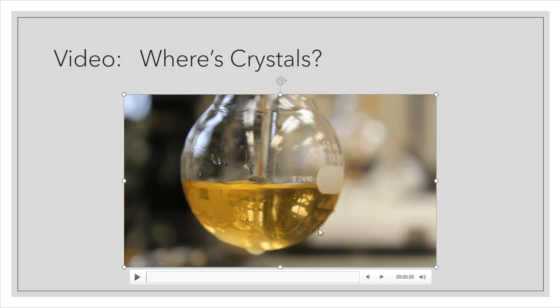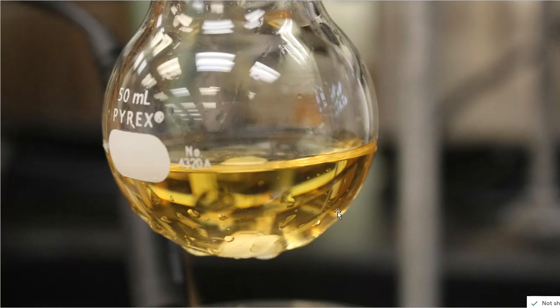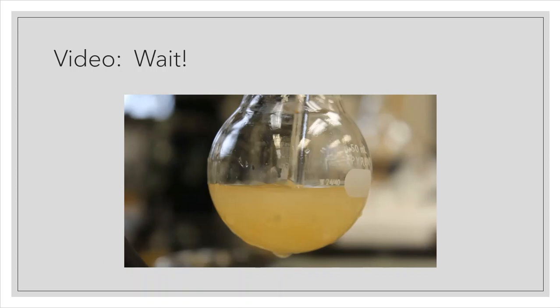Okay, so you might have noticed an observational change almost immediately after I stopped scratching the inside of that surface. Here's a close-up picture of it coming out of the ice bath before that crystallization process took place. And then here's another video that happened just really 1 or 2 minutes after me scratching the inside surface.